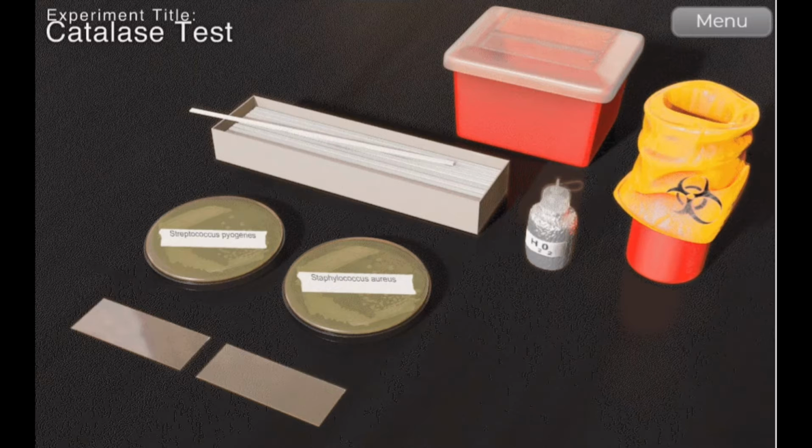Okay, so for the next experiment, I will do a simulation about the catalase test. So first, we need to know the purpose of the catalase test. It is a particularly important test used to determine whether a gram-positive cocci is staphylococci or streptococci. Catalase is an enzyme that converts hydrogen peroxide to water and oxygen gas.